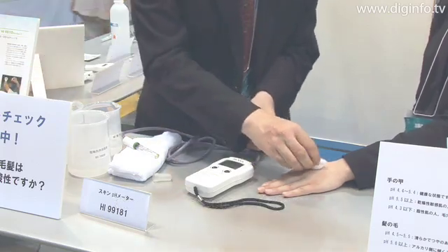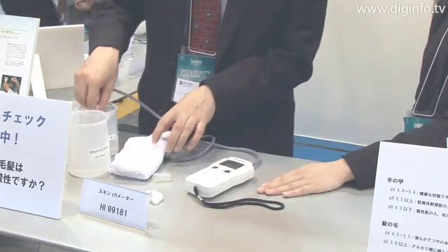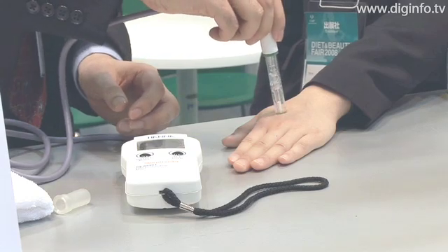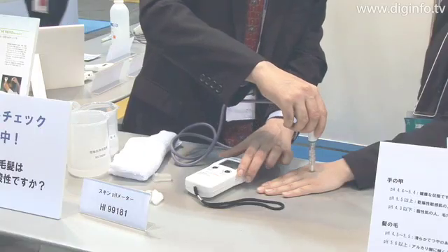When using it to measure pH, all the user has to do is dampen the edge of the electrode and the skin with purified water, then apply the electrode to the skin. The built-in thermometer provides temperature compensation to digitally show stable measurement precision.